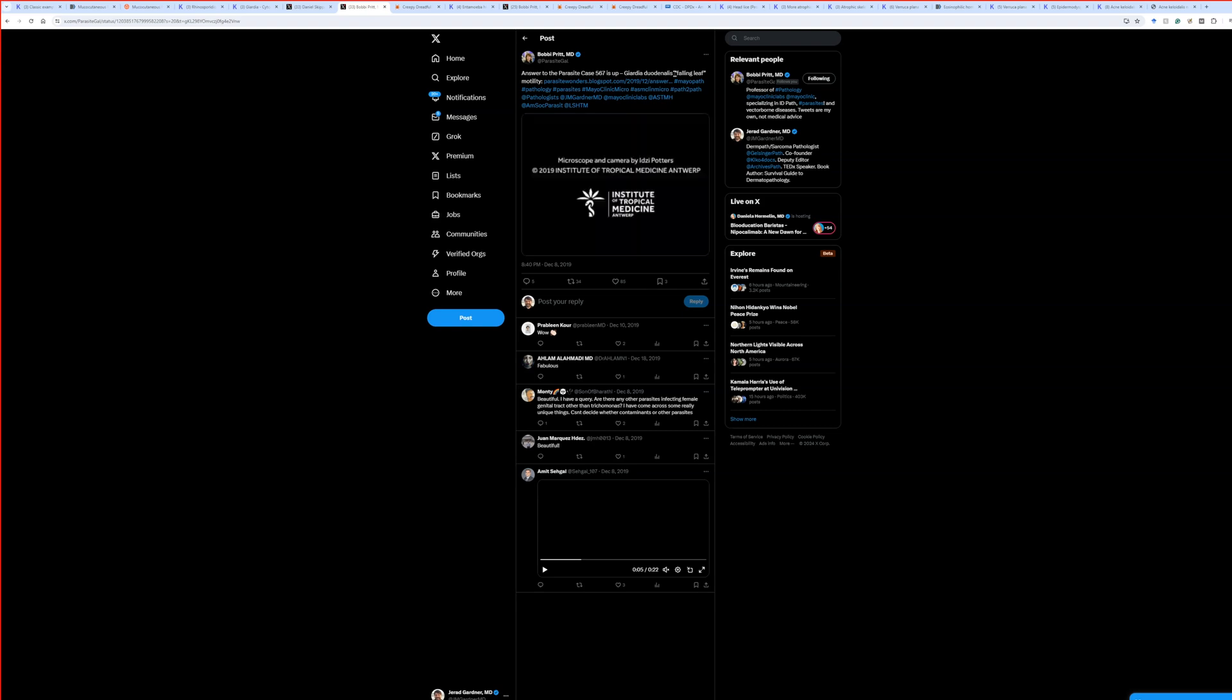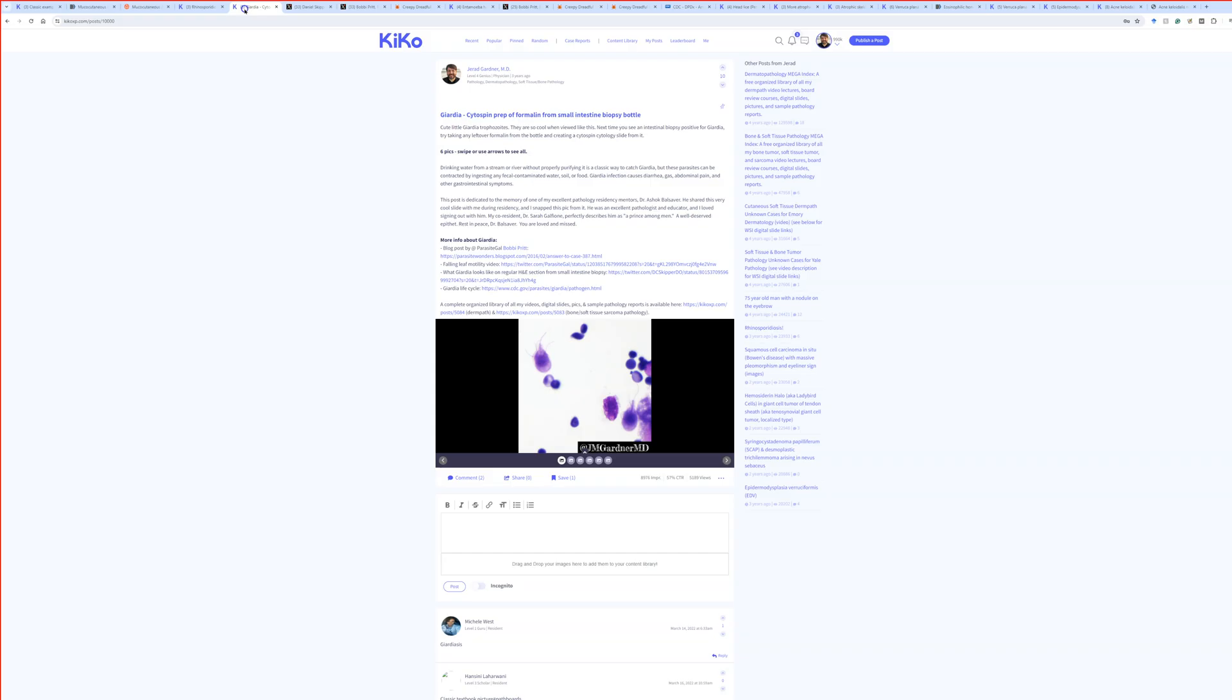So that's called the falling leaf type of motility. So that kind of that swaying, twisting motion from those little flagella there behind the organism. So it kind of propels them around.